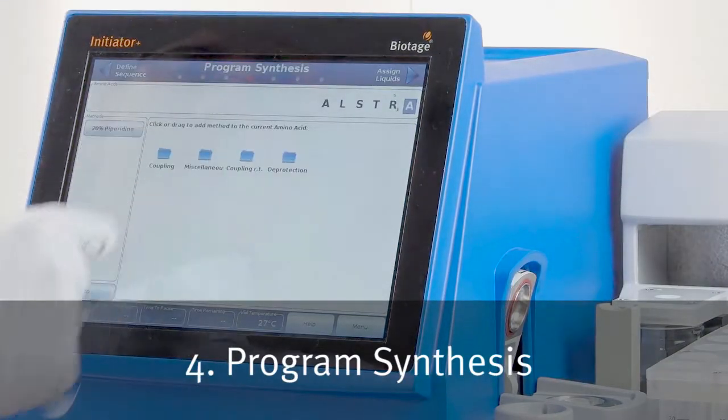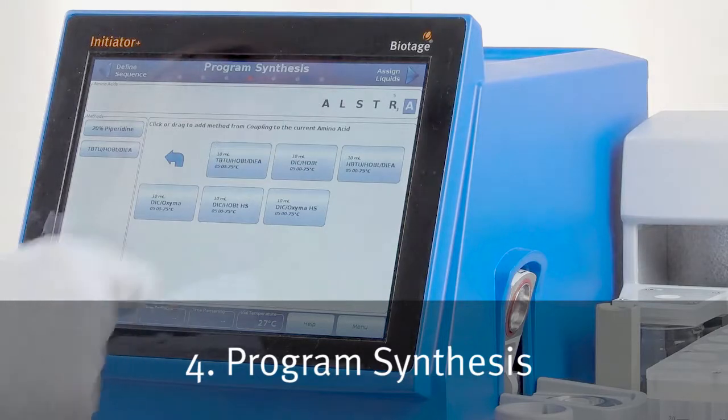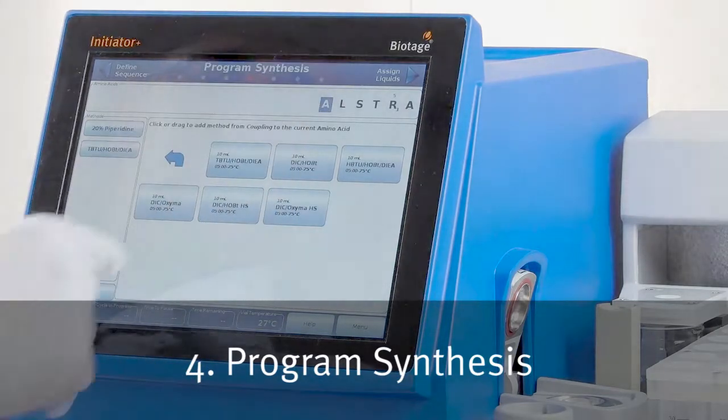Program the methods for each cycle. Easily change parameters such as temperature and reaction time for any amino acid.